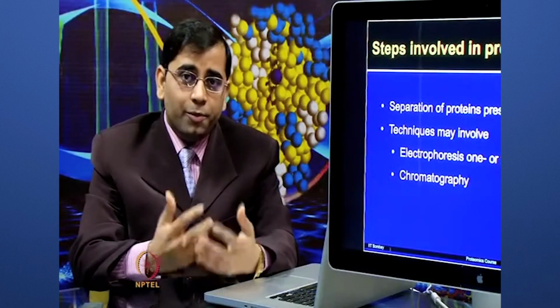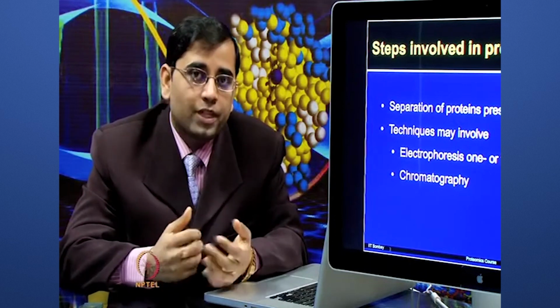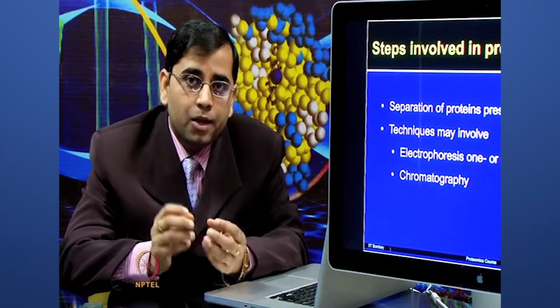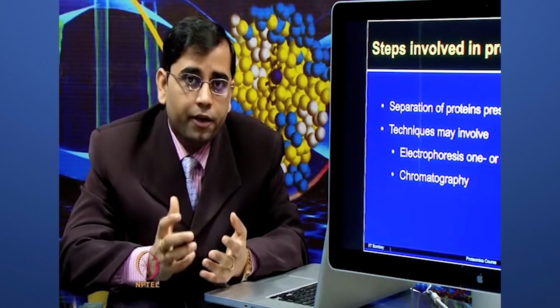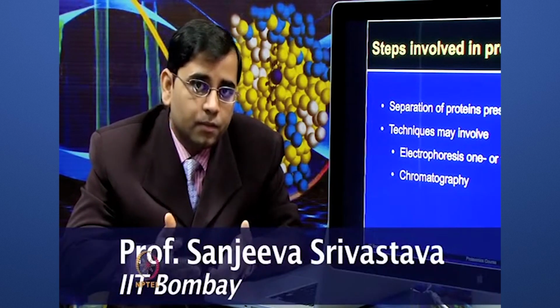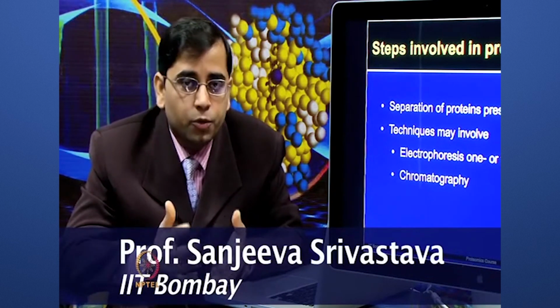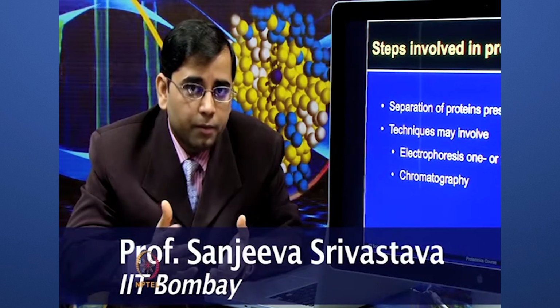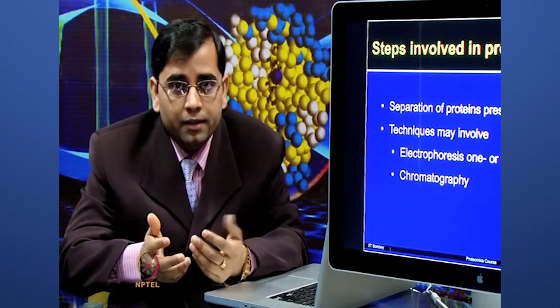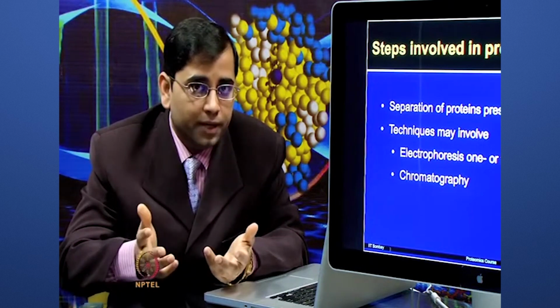So, in proteomics you always have various options available to analyze your protein samples. It depends on your applications and the biological questions which you want to ask, and what information you want to obtain from that particular technique. If you just want to verify that your protein is very pure, maybe SDS-PAGE electrophoresis is good enough. If you want to determine the subunit compositions, you can compare that on SDS-PAGE and native PAGE.